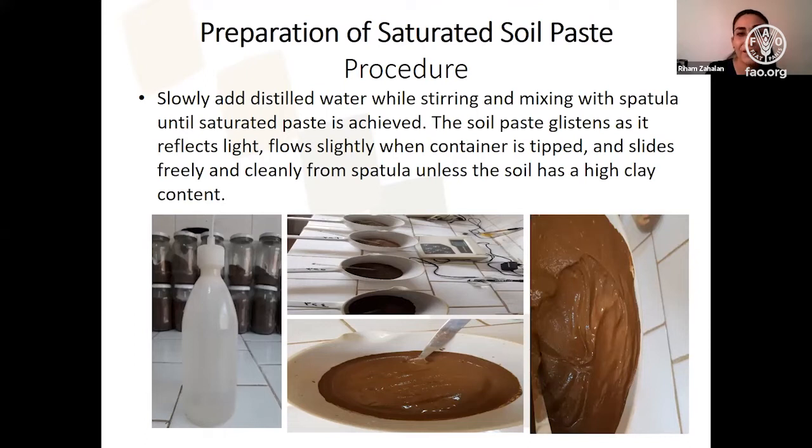Here, there is a famous question: when to stop adding the water. Actually, there are special main characteristics of the ideal saturated soil paste. You can see from the picture that shiny surface. It has a metallic luster. It reflects light easily. So you can see that shiny, smooth and fine surface. It flows slightly if you tip the container.